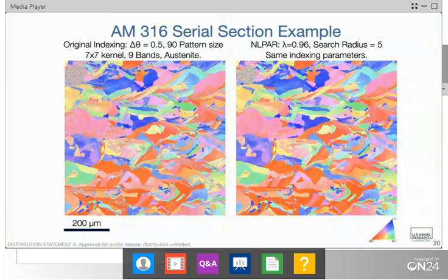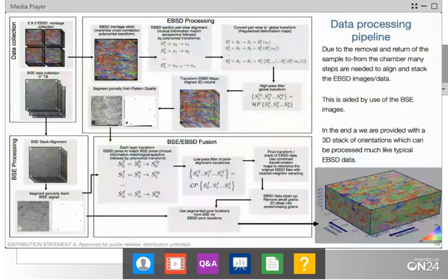But what I want to say is that the way that we had set up this original pipeline of all of these different transformations is that we are saving not the transformed images, but the list of transformations. And so it ends up being this very long list of exactly what transformations go into making up your data. The final reconstruction is actually going back through that whole chain of transformations and referencing the original data just one time. So we're only doing one resampling. And so that really greatly eases things.